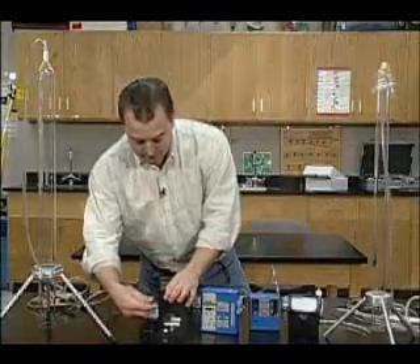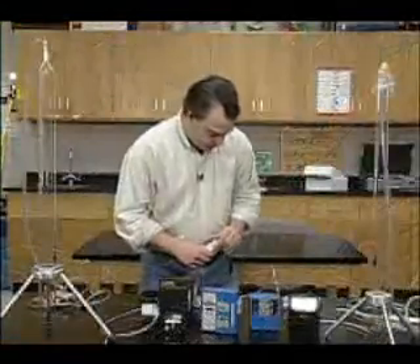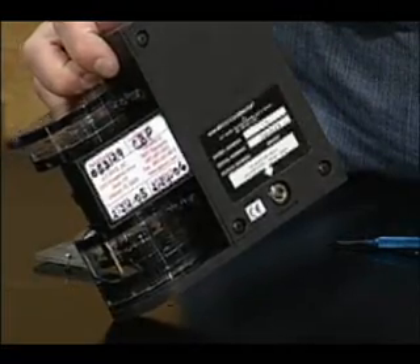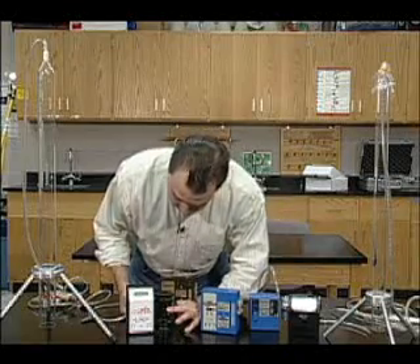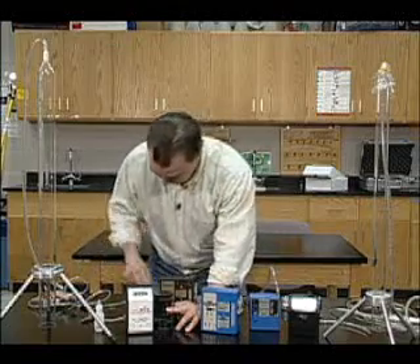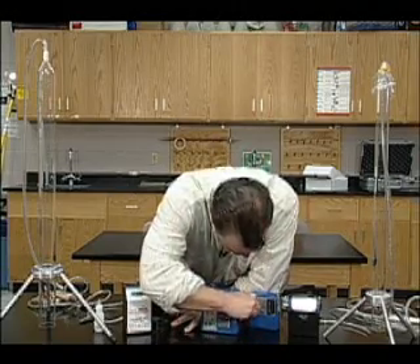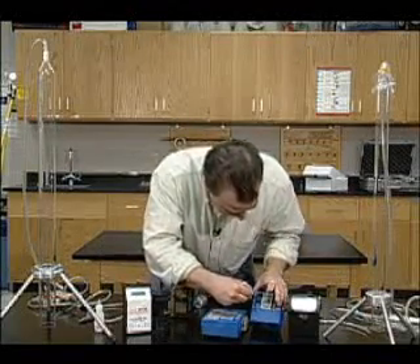Once your sampling pump has been running for five minutes, you put on whatever sampling media you're going to be utilizing and hook it up in the back to the top part. You have to put soap in on the bottom — generally you don't do this when it's hooked up, but you put it in. Then all you do is press this button down and it'll read. Right now we're at 2.77 liters per minute, so we want to adjust the flow rate down. At 2.4, so we need to adjust a little bit more.